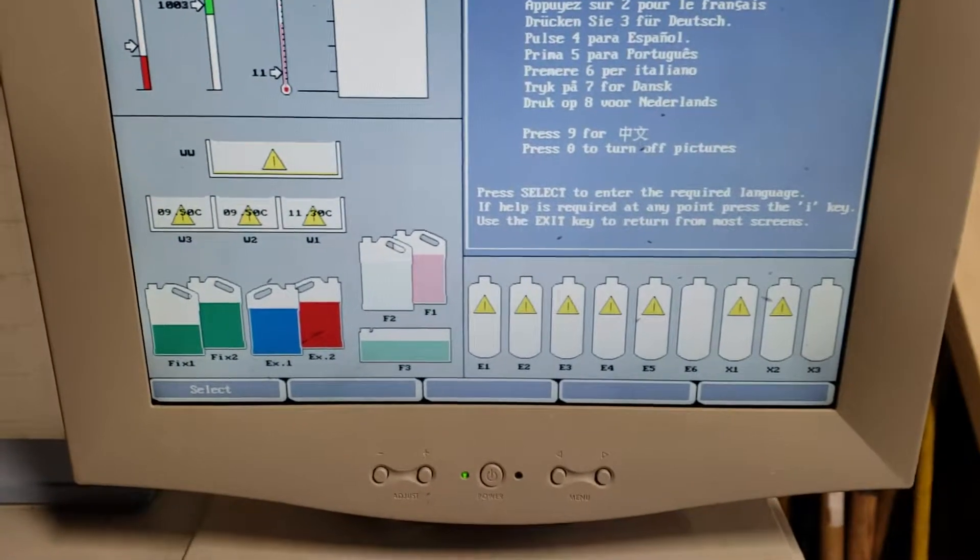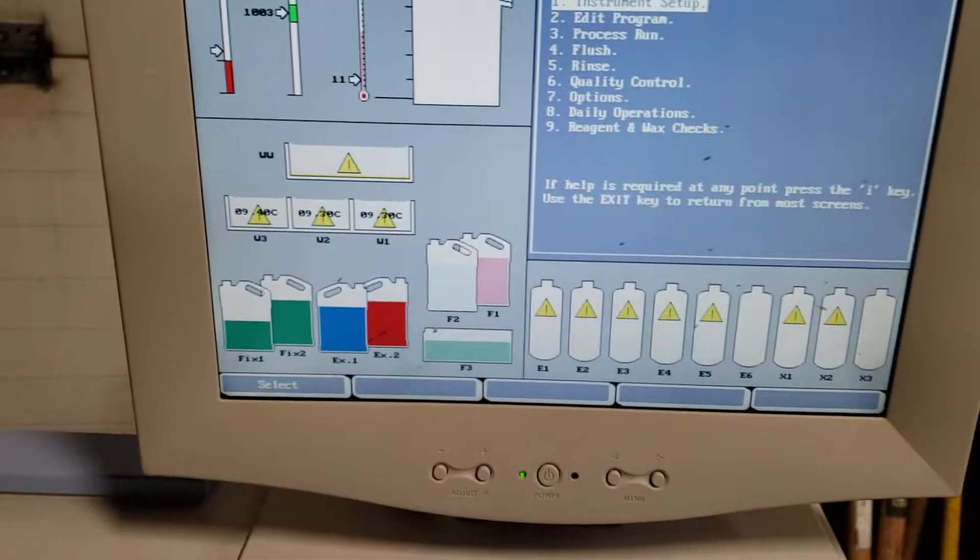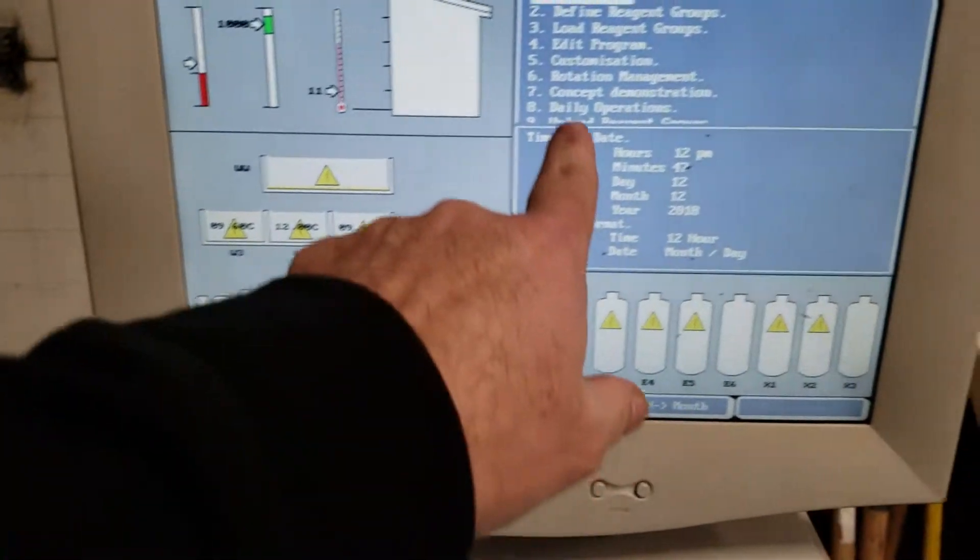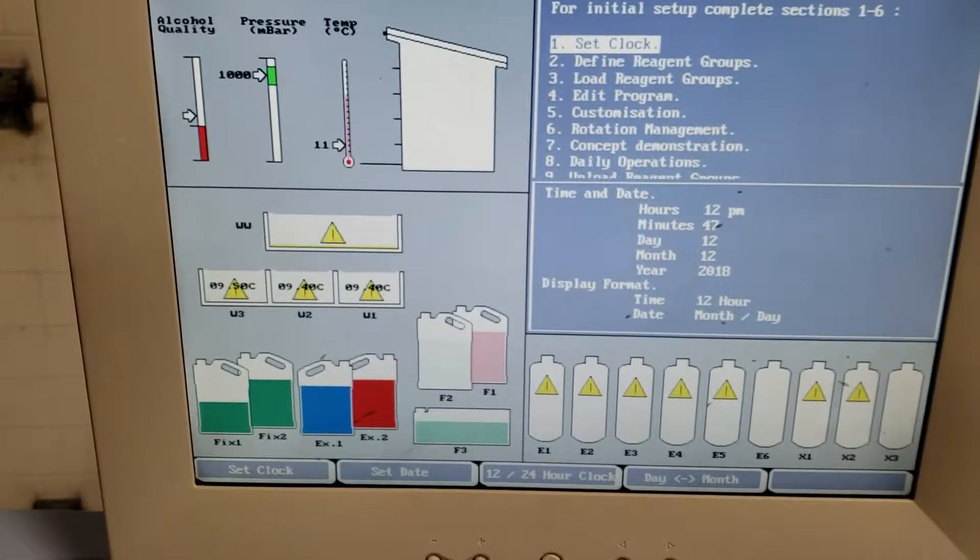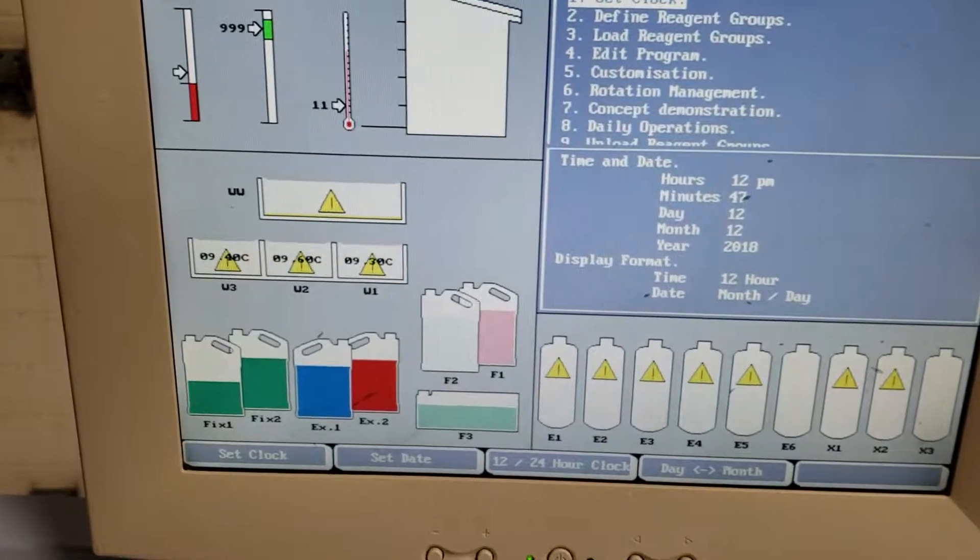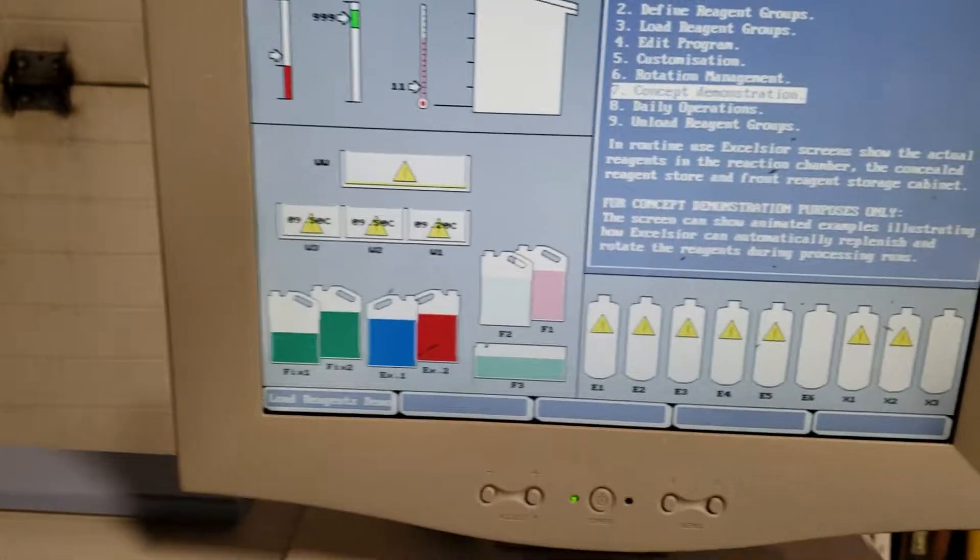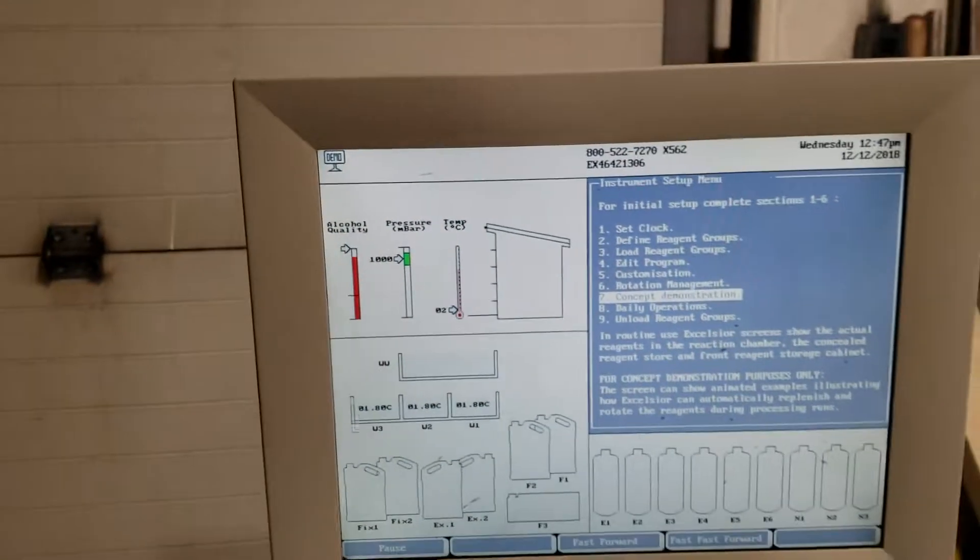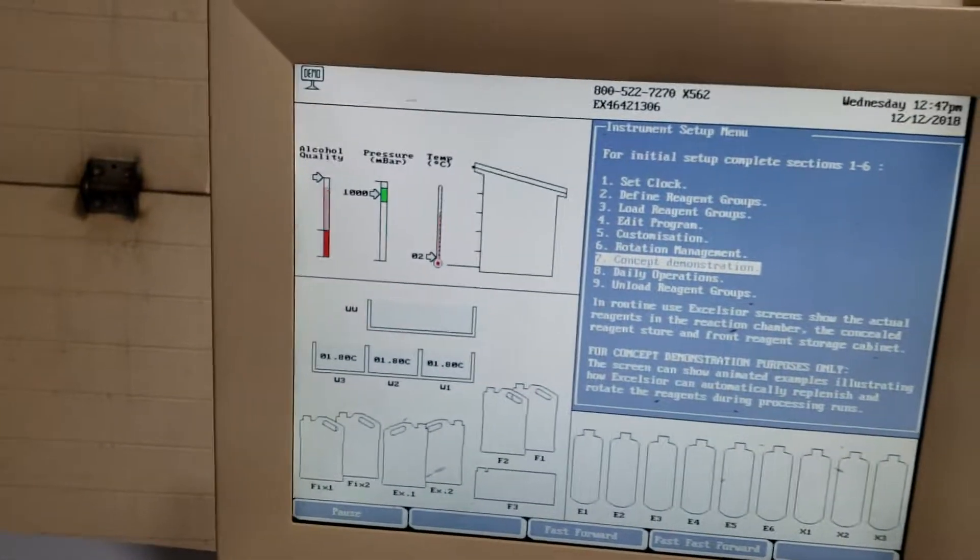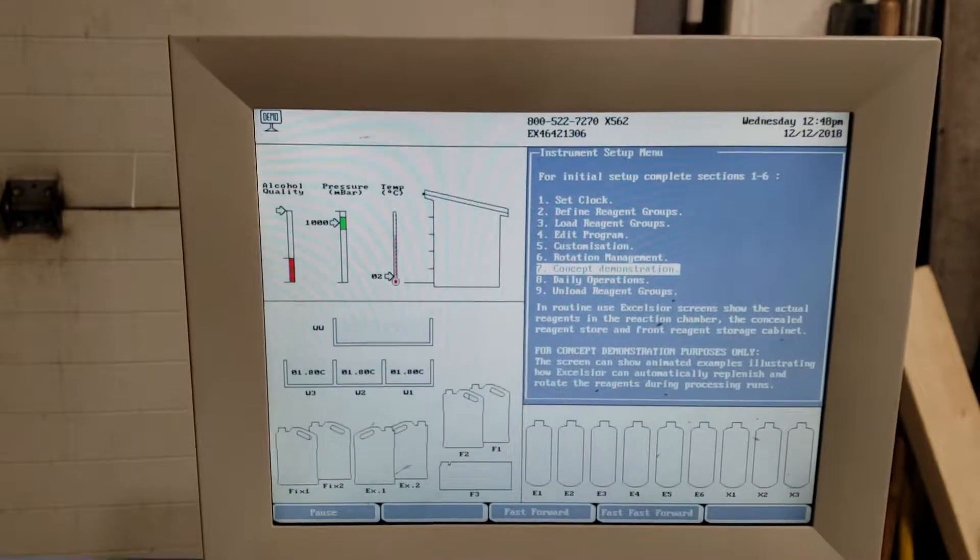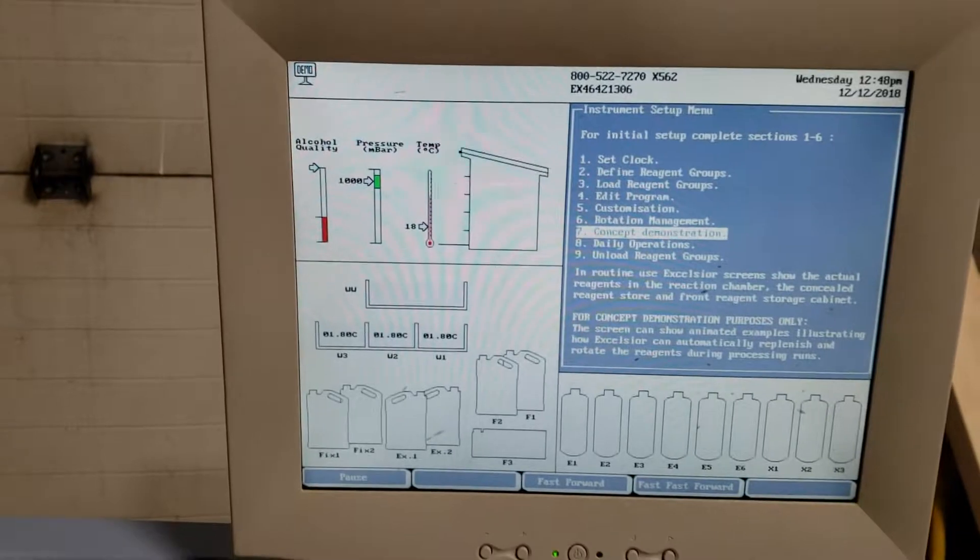Selecting English. I need to press select here. You can do concept number seven, then hit load reagents demo. I'll select this option. Oops, sorry, I forgot it's not a touch screen.